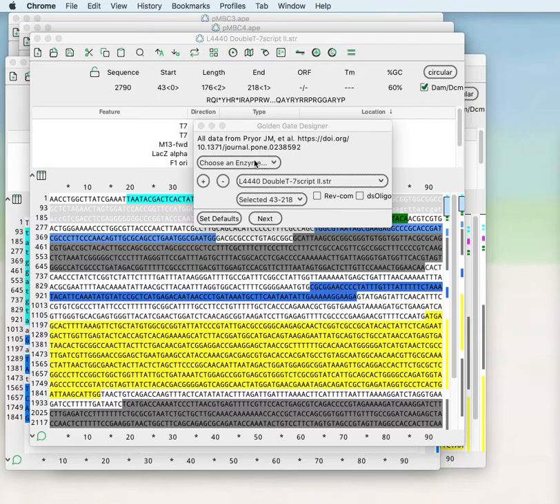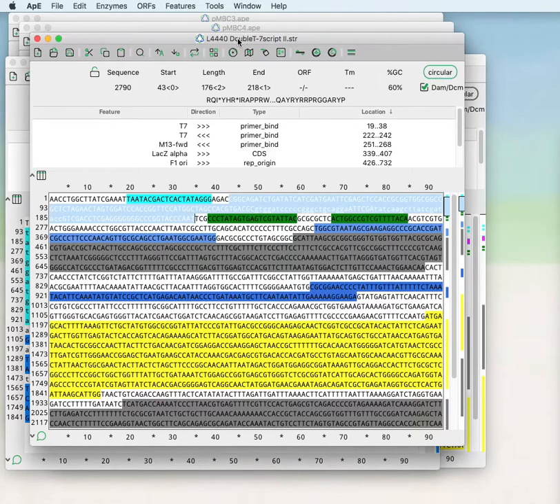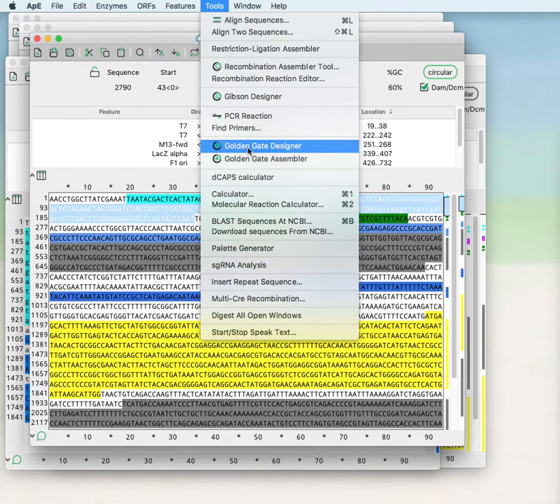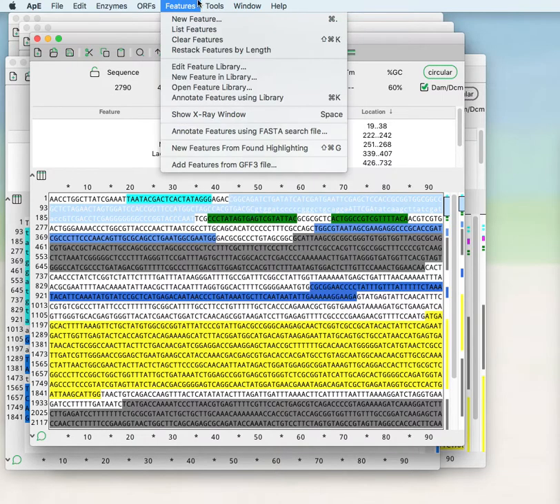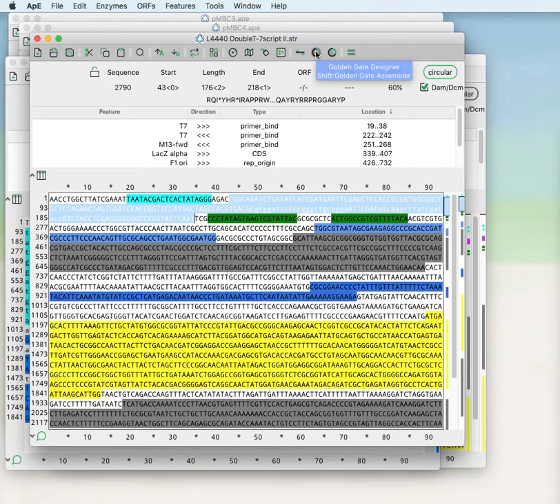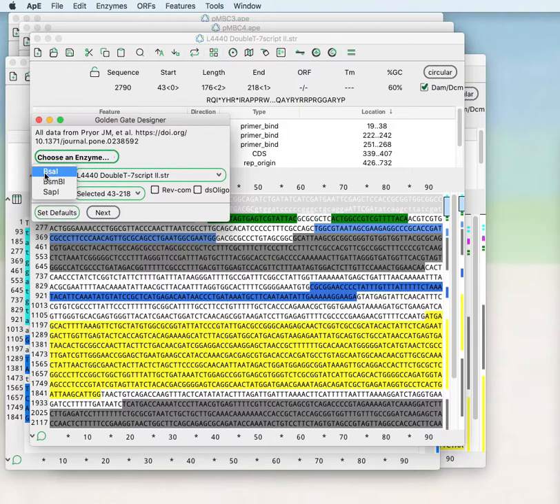When you open the designer tool you can do that from the Golden Gate designer under the main tools menu or from the Golden Gate toolbar icon. You can choose a type 2s restriction enzyme. This will list the ones that you presently have in your enzyme set.